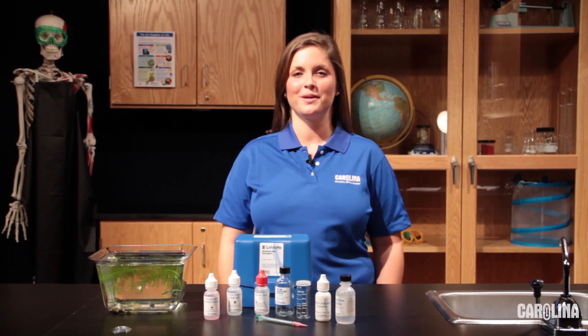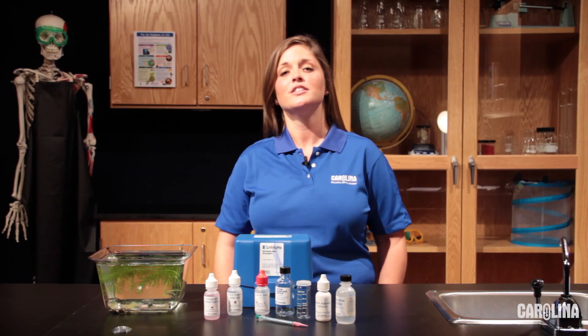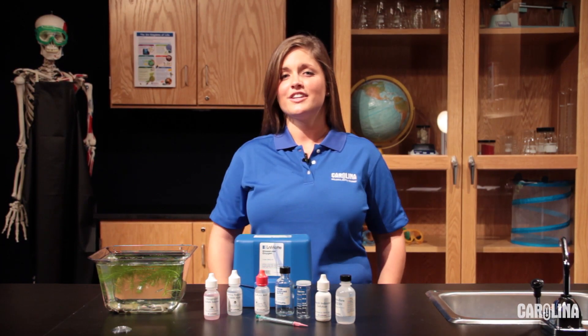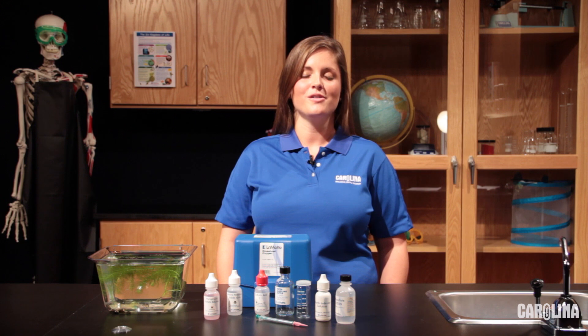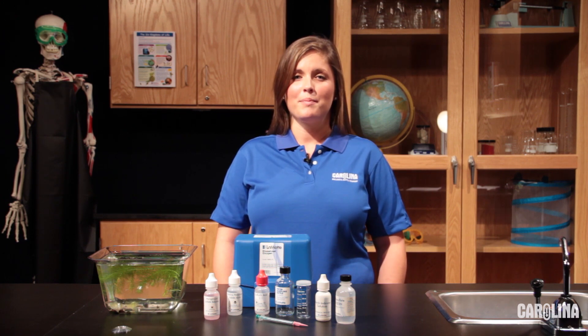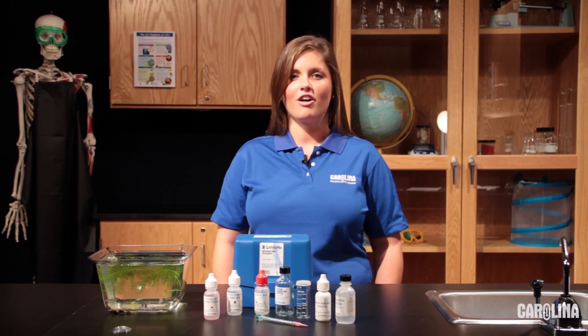There are two main parts to the Winkler method protocol. The first is a series of steps designed to fix the amount of oxygen in your sample so that the addition of more oxygen doesn't skew your results. During the second part of the protocol, we will conduct a titration to measure the amount of dissolved oxygen in your original sample. We recommend the use of proper safety equipment during this procedure, including gloves and goggles.